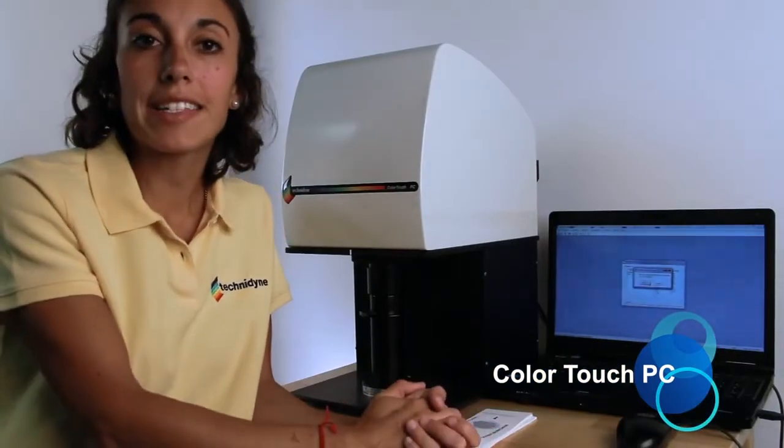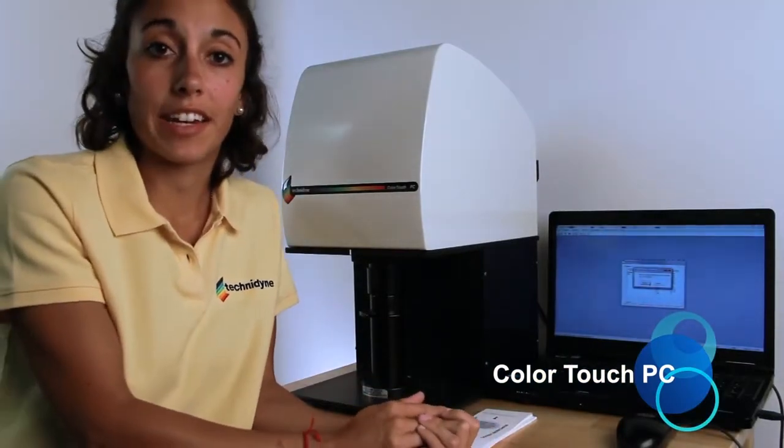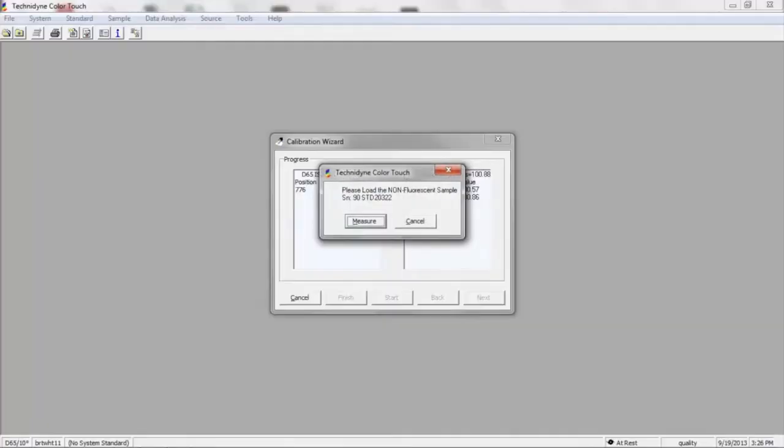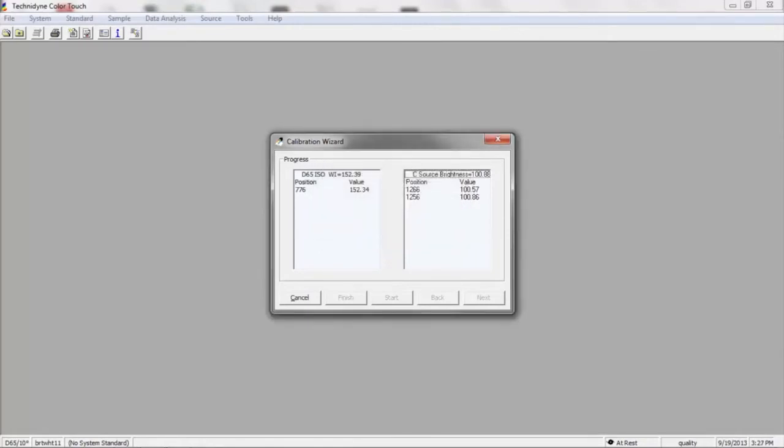Finally, our last step is to reload our 90 standard and press measure. This is the last verification of calibration at each filter position, and it's also the final calibration of the internal swing-in standard at each filter position.